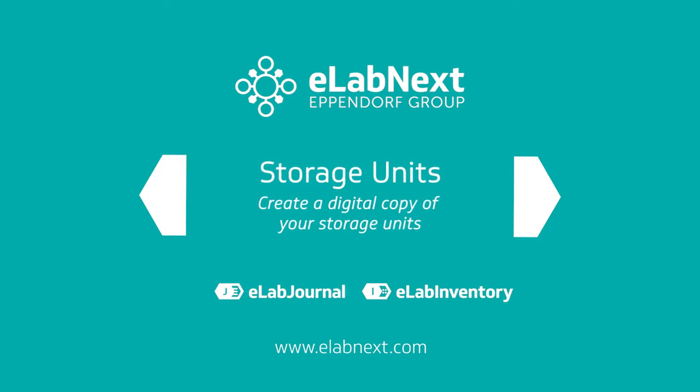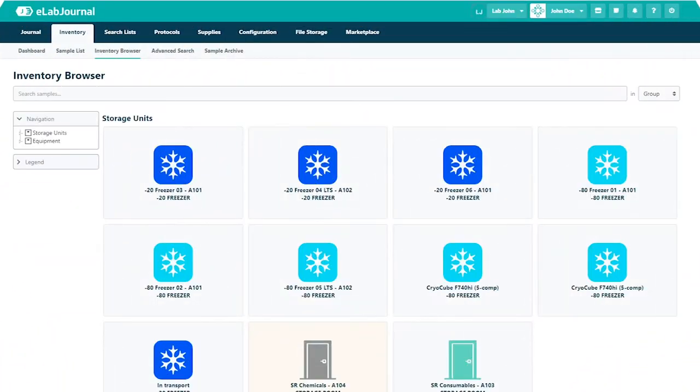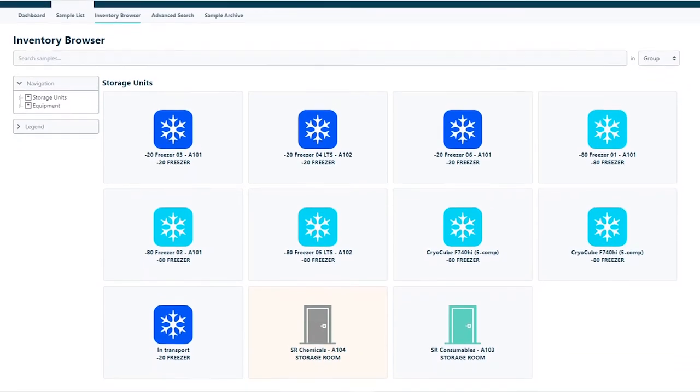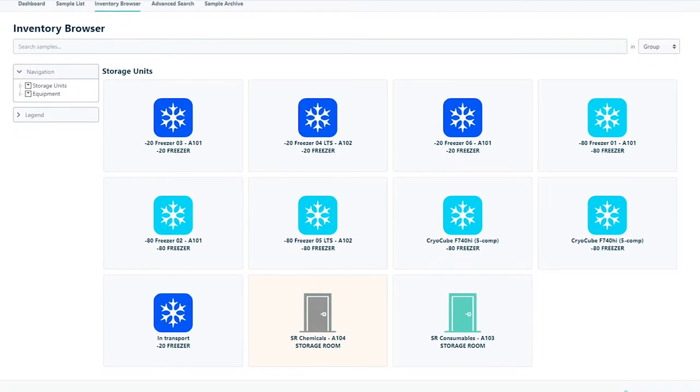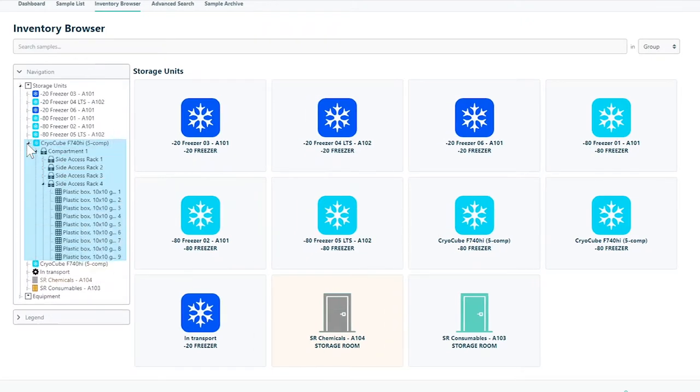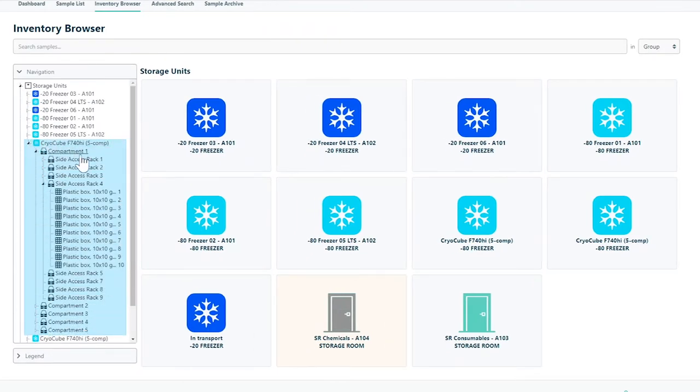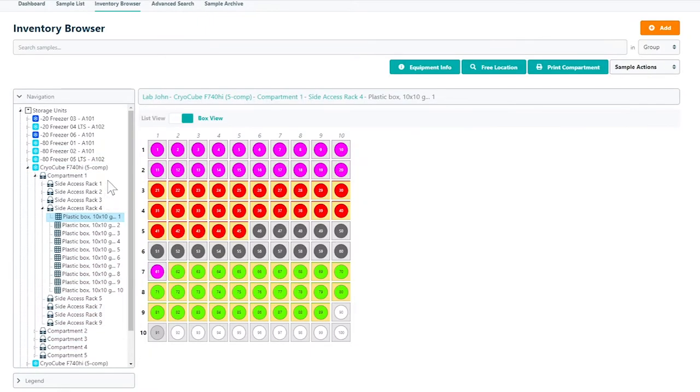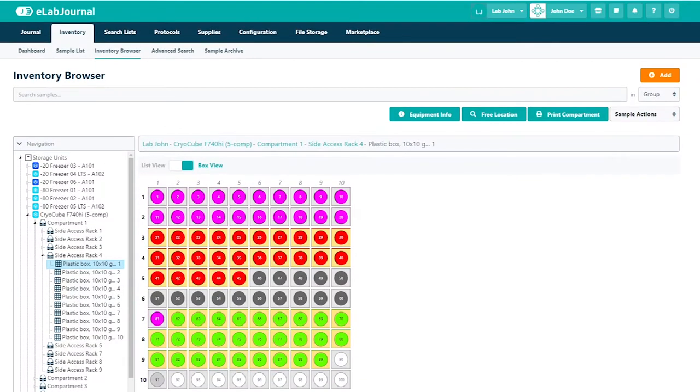In this video you'll be learning how to create a digital copy of your storage units. The inventory browser offers an overview of all storage locations in your lab. By adding freezers, cabinets and more you can create a virtual representation of what is available within your lab or organization.